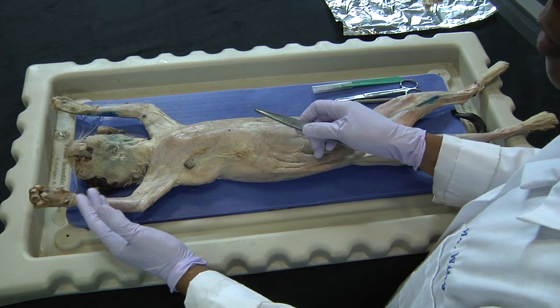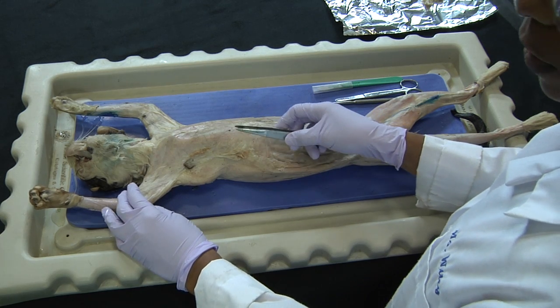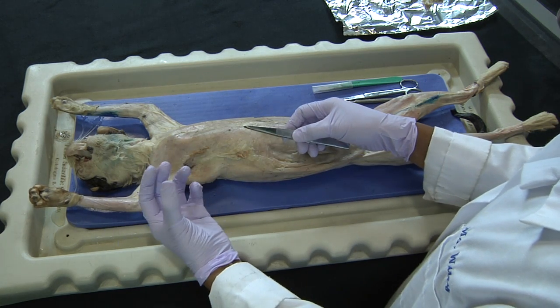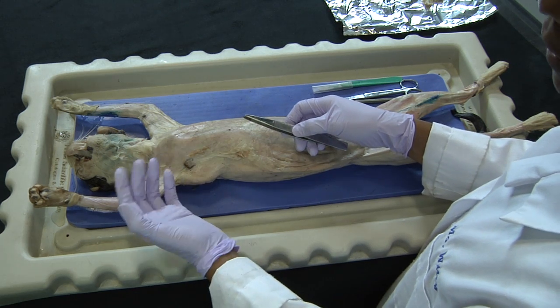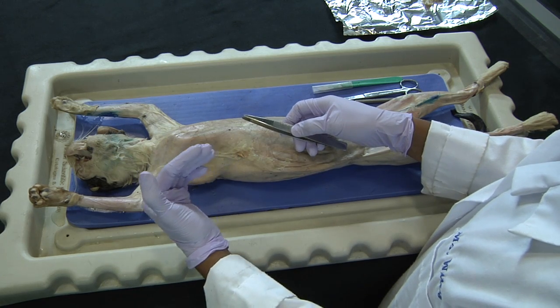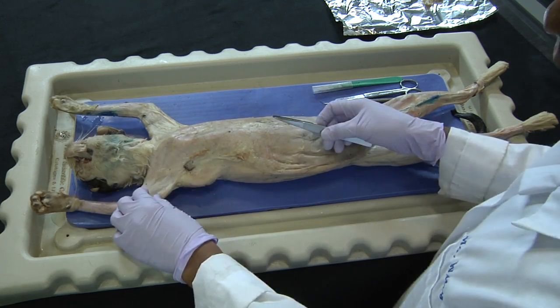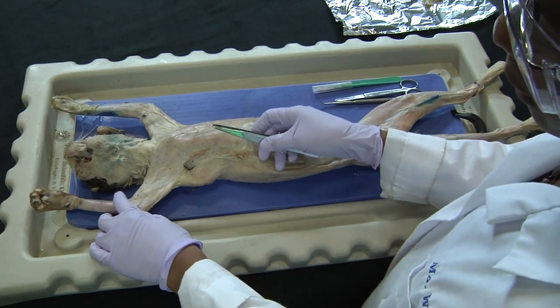The connective tissue that is important to get rid of is the loose connective tissue — in particular, the adipose tissue, which is fat, as well as the areolar connective tissue, which is a loose connective tissue important in nourishing the skin. It is highly vascularized, meaning it has lots of blood vessels, which is important because epithelial tissue does not have its own blood supply.